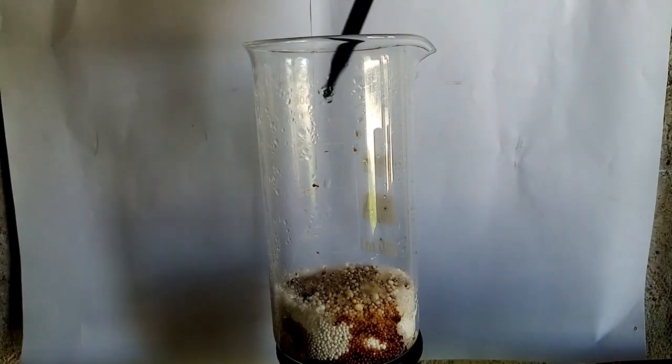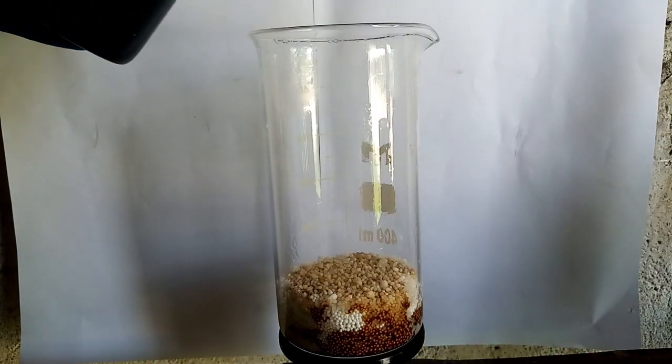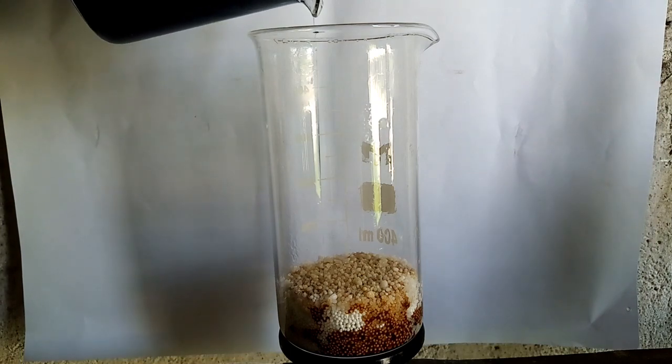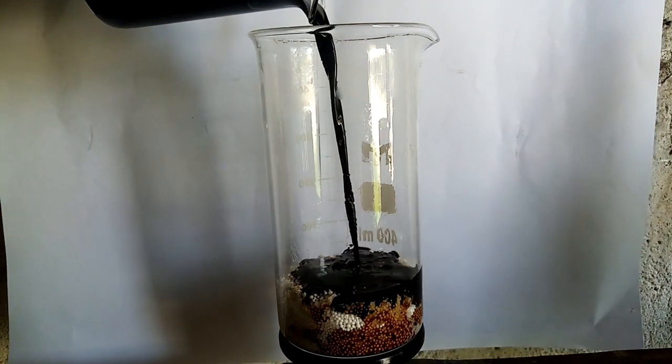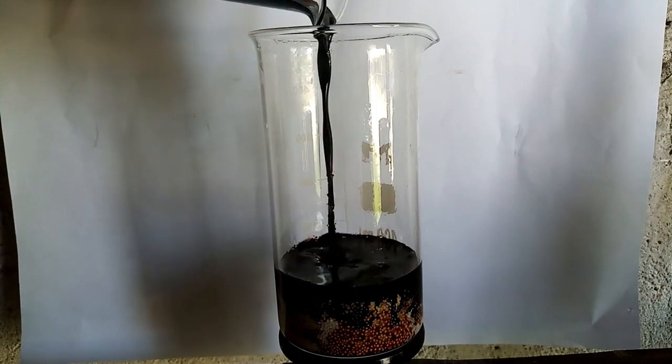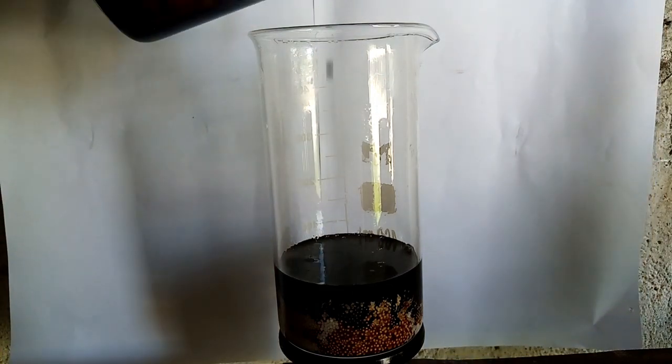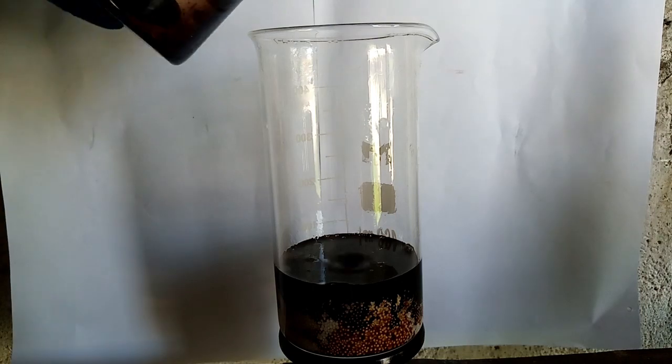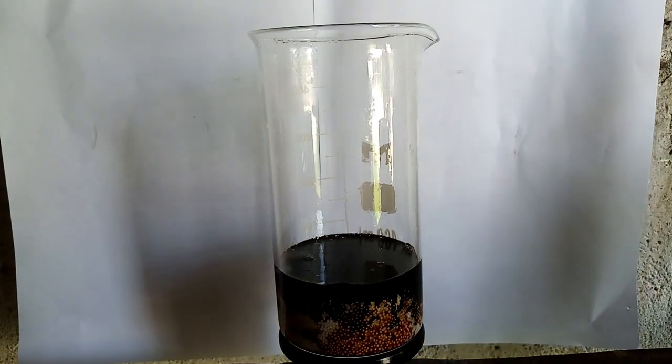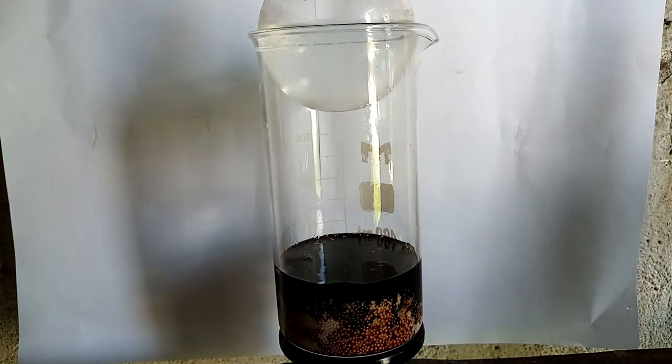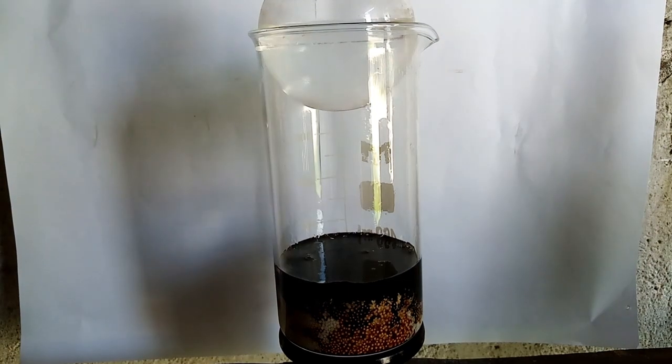After I see not really much is happening, I pour all of the acid. After I pour the acid, I take the boiling flask with cold water and put it on the beaker to prevent any vapor of nitric acid or nitrogen dioxide from escaping.